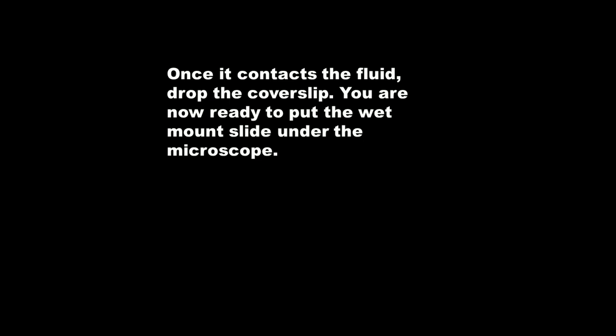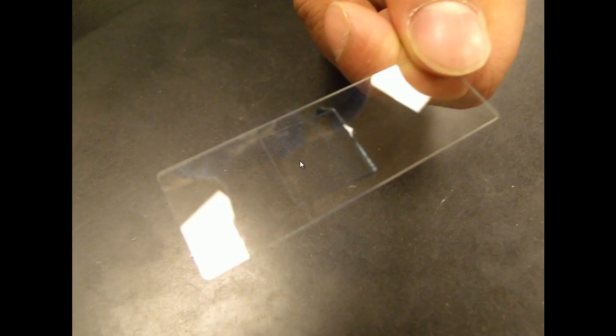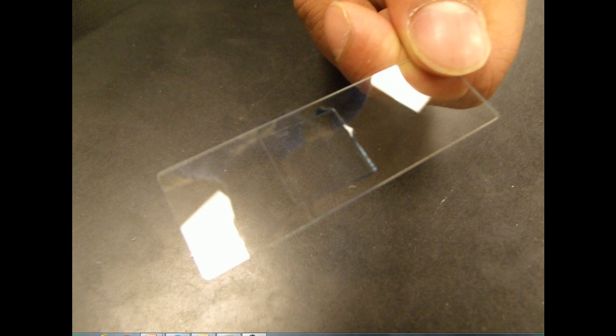You're now ready to put the wet mount slide under the microscope and you can see there's a very thin layer of blue fluid under the cover slip which will give you a good tissue sample.